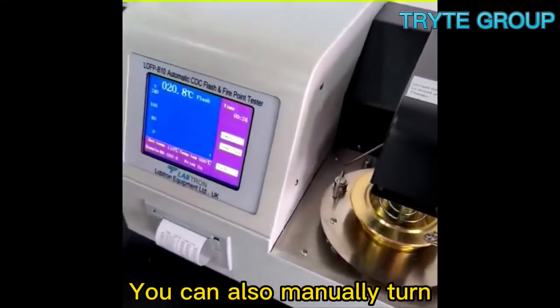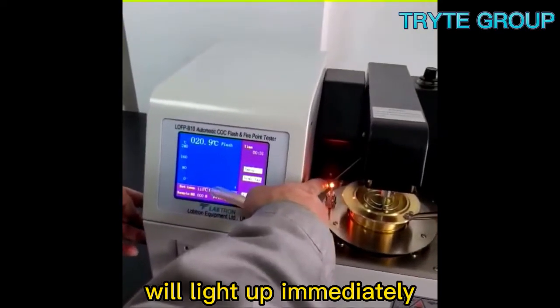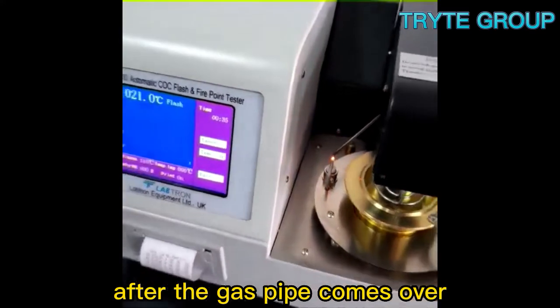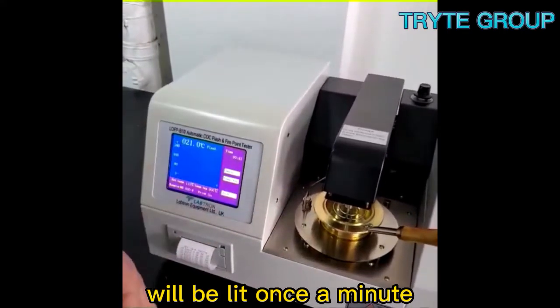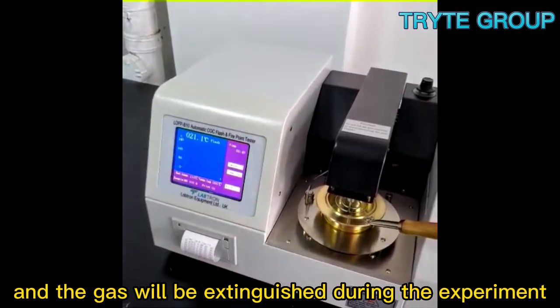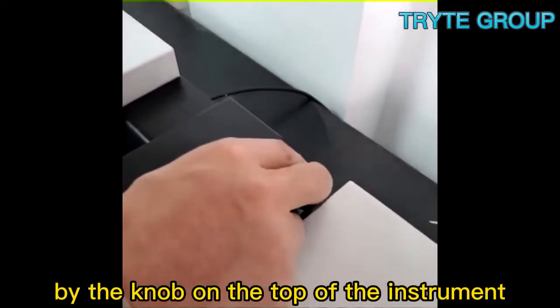You can also manually turn on the button on the power switch. The auxiliary ignition head will light up immediately, and the gas can be ignited after the gas pipe comes over. During the experiment, the auxiliary ignition head will be lit once a minute, and the gas will be extinguished during the experiment. The size of the flame can be controlled by the knob on the top of the instrument.